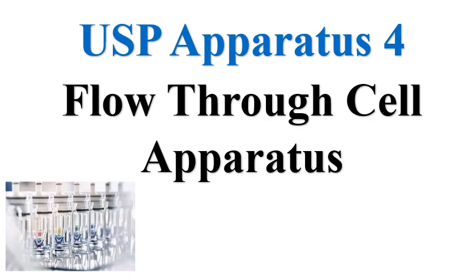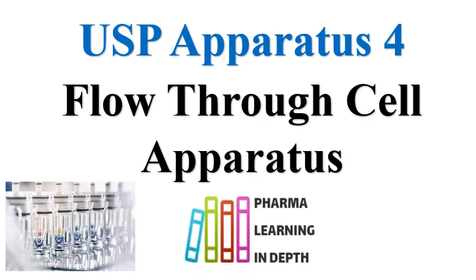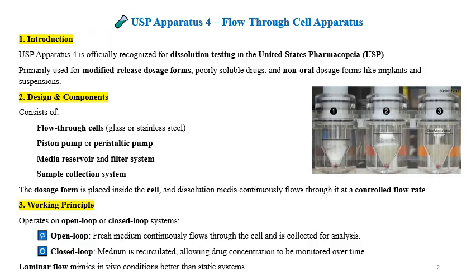USP Apparatus 4 for dissolution testing is also called the flow-through cell apparatus. This apparatus is not used widely, as it is specialized for some formulation types.